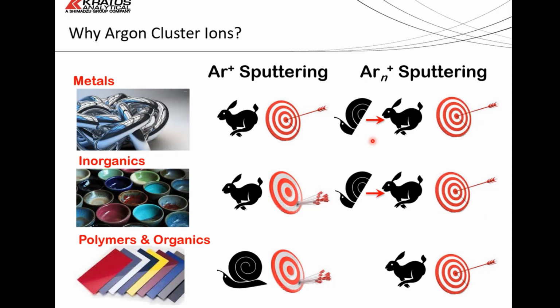That helps to mitigate the problem by spreading the energy in your projectile over several different atomic centers. So along came what's now the standard in surface analysis, using argon cluster ions. These are big balls of argon, held together by van der Waals forces. So they're weakly held together, like giant ice balls floating through your vacuum system. These have proved very popular and effective.